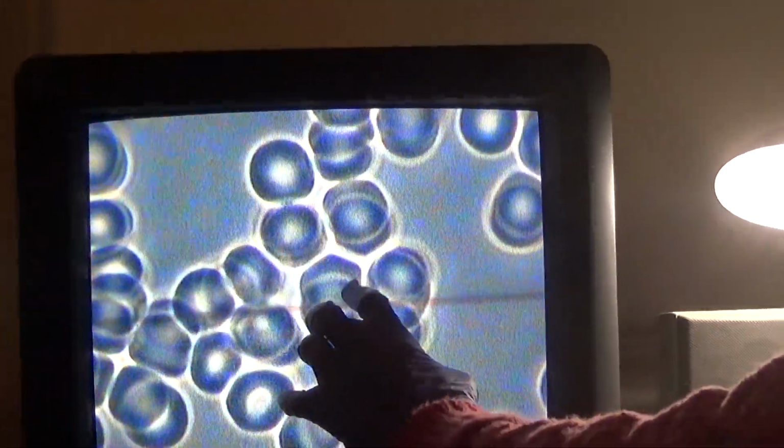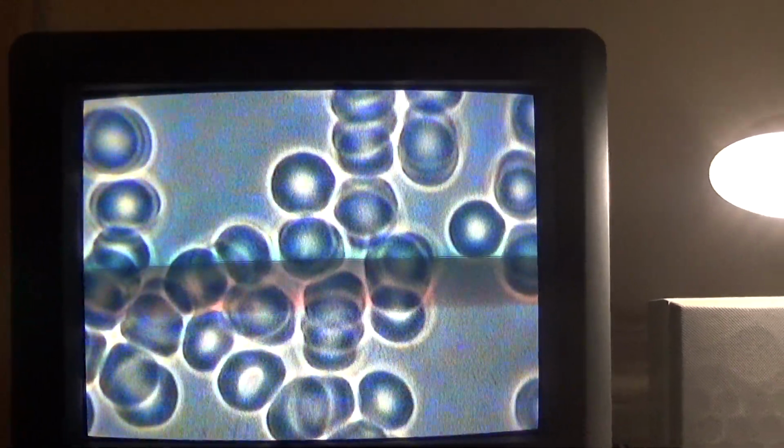But you also have this rouleau kind of thing going on. Rouleau is where the red blood cells are adhering to each other. They can make long chains that look like rolls of coins, that look like this. This is the worst case scenario of rouleau. The first stage of the formation is called protein linkage, where you see little points on the cells. I always give you a score from 0, if your blood looks like this, to 5, if it looks like this. So I'll evaluate on average about how much of this rouleau condition you have.